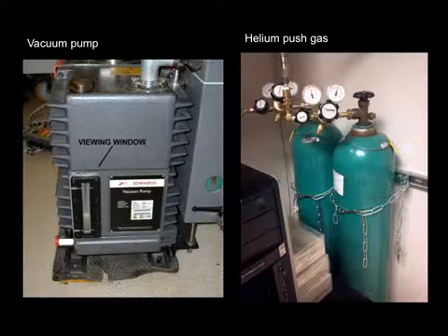And so this is also responsible for most of the noise that you hear when the system is in operation, when it's in the non-idle status, so when it's on. And there's also this helium push gas, which you need to keep an eye on as well. You want to make sure that you've got sufficient helium gas pressure here. So this pressure is used for pushing the dissolution solvent very quickly out of the bomb that sits above the polarizer and down into the sample, and so you can really rapidly dissolve your sample.